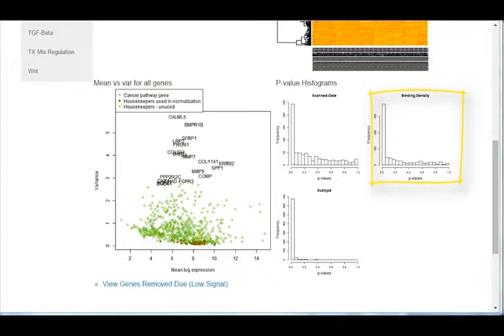Binding density serves as a surrogate for total RNA input. Samples with low RNA input will be given larger normalization factors, and normalized expression of genes in or near the background of the system will vary with the sample's normalization factor. Thus, binding density will often predict the normalized expression of genes in the background. Finally, and encouragingly, our biological variable of interest, subtype, appears to profoundly influence gene expression. Its histogram is by far the most left-weighted of all of them, indicating that almost every gene in the analysis appears to respond to subtype.